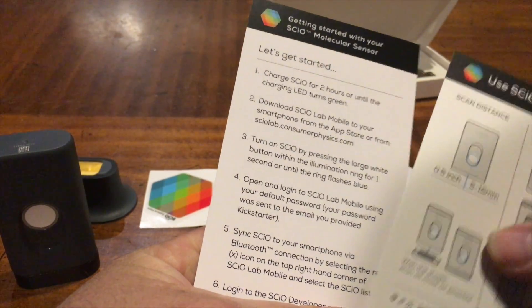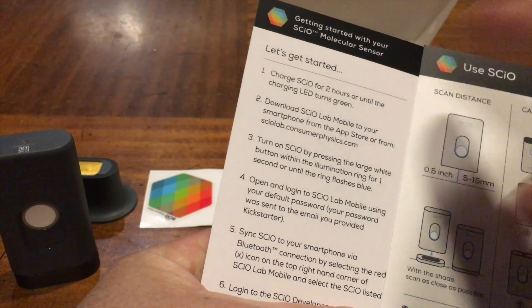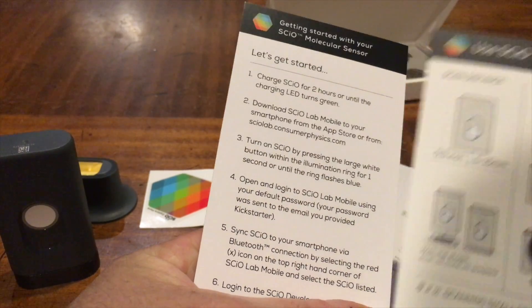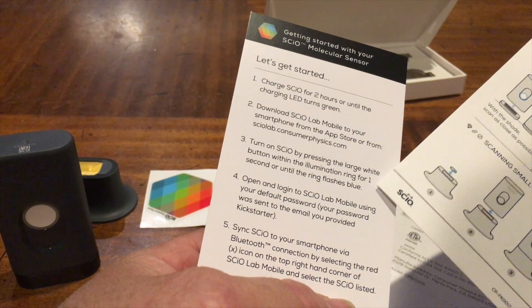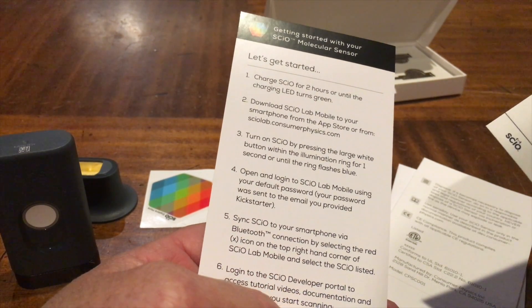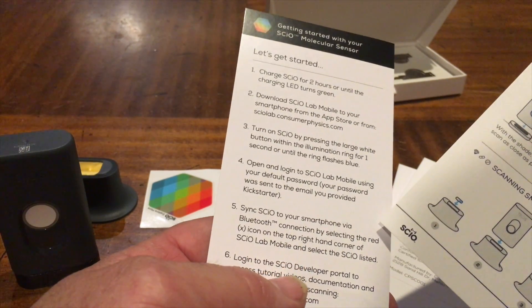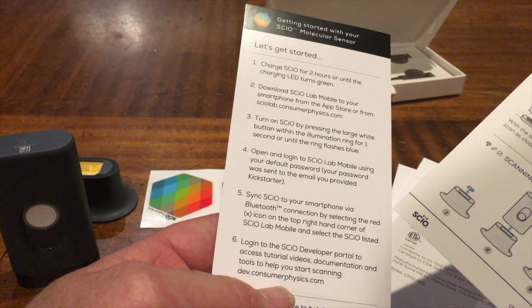Charge it for two hours or until the charging LED turns green. I've already downloaded the app. Turn on the Sayo by pressing the large white button for one second or until the ring flashes blue. Open the app and sync it via Bluetooth connection.